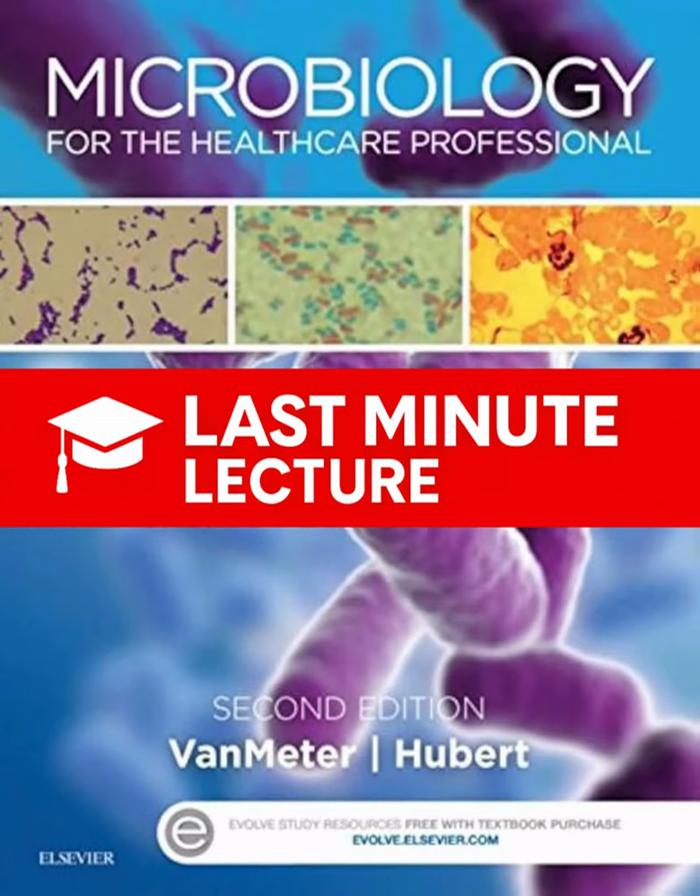Fascinating. And there's another key differential stain, acid-fast. Yes, the acid-fast stain. This one's specifically for bacteria that have waxy mycolic acid in their cell walls, which makes them resist gram staining. The main group here is Mycobacterium, the ones that cause tuberculosis and leprosy. So that waxiness needs a special approach. It does. You have to use a potent primary stain, carbofuchsin, and often apply heat, that's the Ziehl-Neelsen method, or use a stronger formulation, the Kinyoun method, to drive that stain through the waxy layer. Once the red carbofuchsin's in, that same waxy layer makes them resistant to decolorization by acid alcohol. So acid-fast bacteria hold on to the red stain, while non-acid-fast bacteria get decolorized and then pick up the blue counterstain.